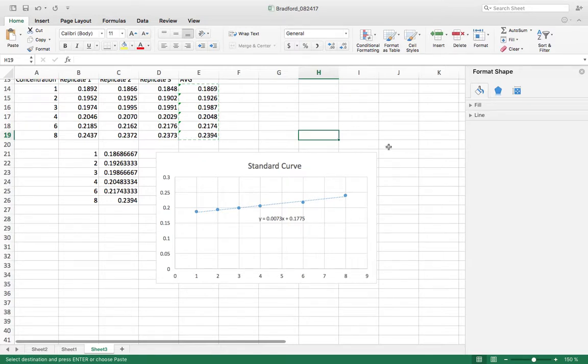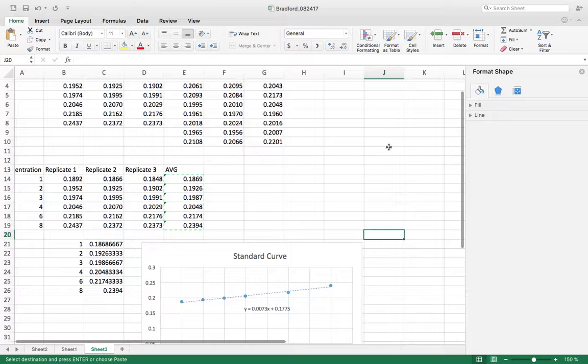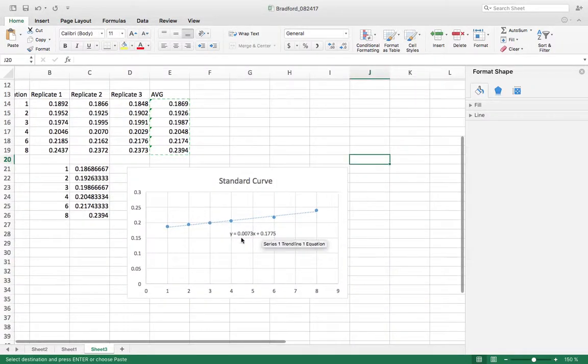So, and you still get the same result, and it's all good. So now we have the standard curve. We know that the relation between increasing concentration has this slope and this b value, y equals mx plus b, when you're considering how the absorbance goes up. And you'll notice the absorbance doesn't change too much, but now we can plot anywhere on this line, like say we had a concentration of 4.5, it would plot right here, and that is the absorbance that we would see in a 4.5 concentration.